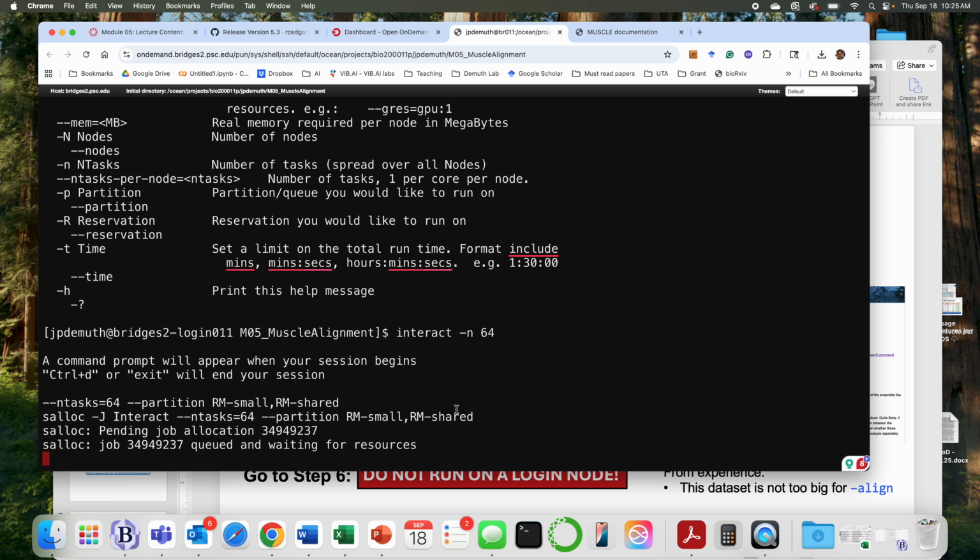Okay, I probably just made a little typo. Oh my gosh, okay, thank you. The reason I keep making those mistakes is I don't understand how to only change this. Is it this? Oh, I see. Okay, so now I'm running it again.